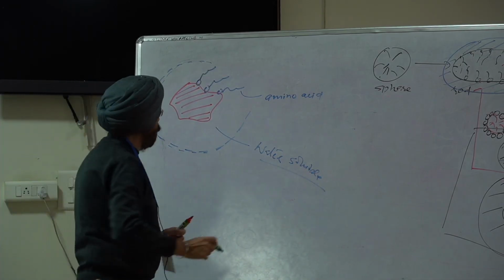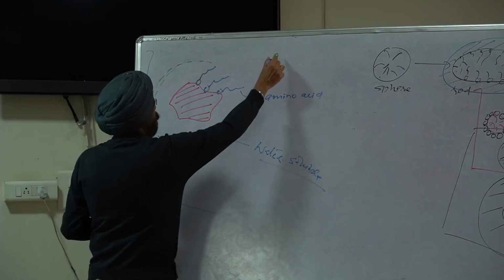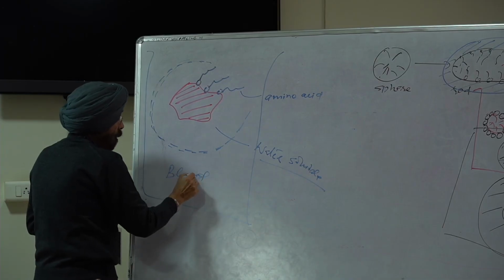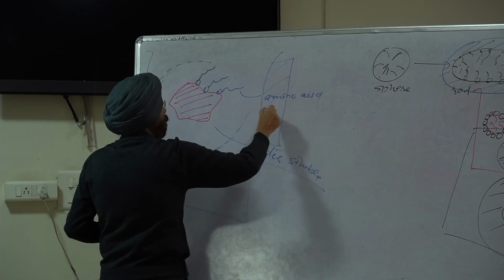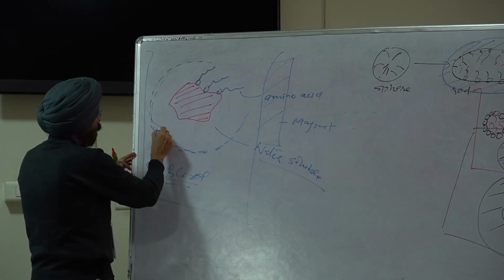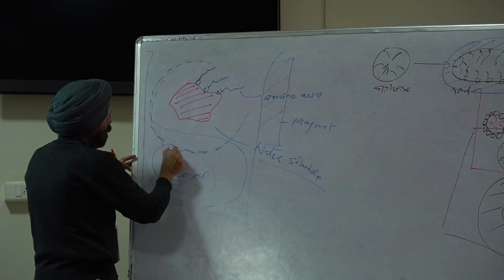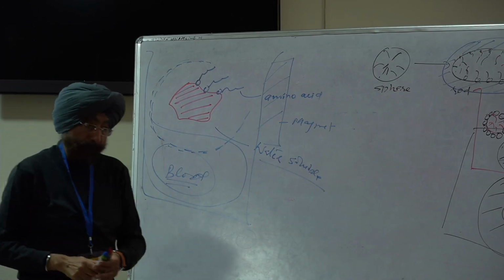When we place such a nanoparticle in the blood suspension, and place the magnet over here, we want to see how many blood cells are going to be extracted by the magnetic nanoparticle using the magnet.